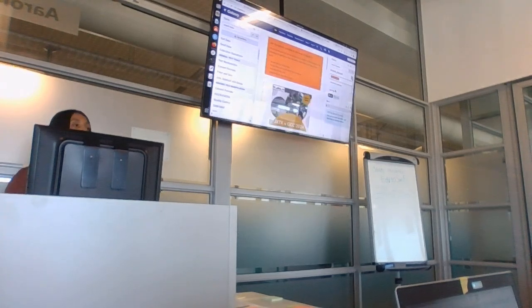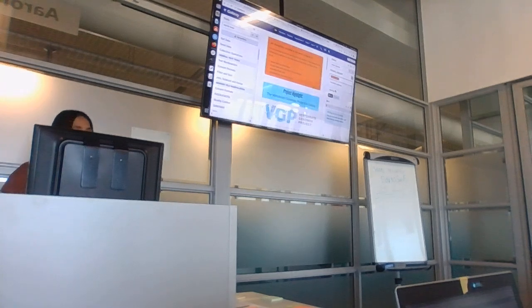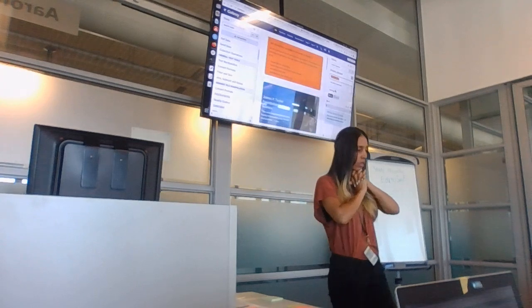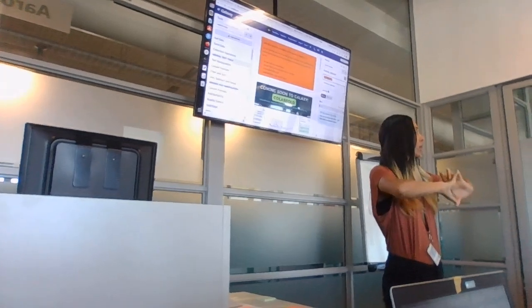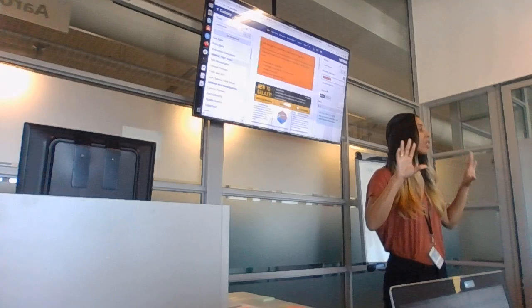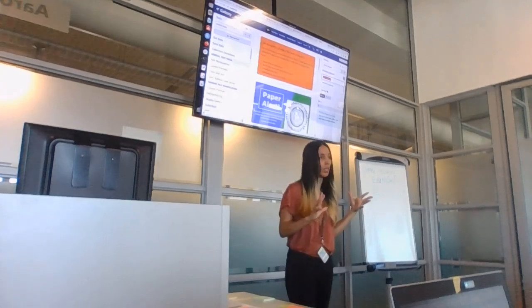Now, one thing you can also do, and this is not in the notes. So maybe if you are following the notes, just pay attention here now. Sometimes you are processing, especially if you're doing something like RNA-seq. Who's done RNA-seq analysis before? You would be doing a differential analysis, right? So you maybe have your control samples versus your treated samples.